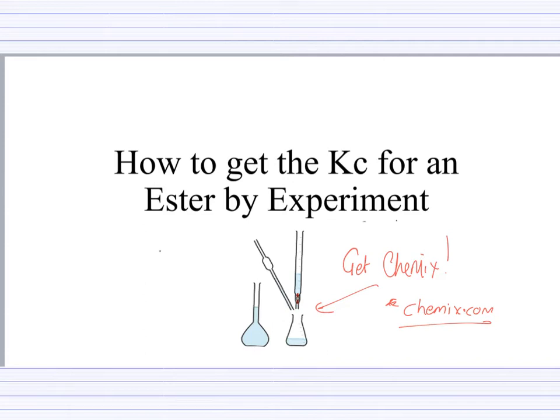In this short video, what we're going to be looking at is how to use experimental data to find the Kc for esterification. So the experiment we're going to be using is a titration. Now, for my apparatus here, for my storyboarding, I use the amazing website called Chemix. I really urge you to go have a look at that for when we start to designing experiments.